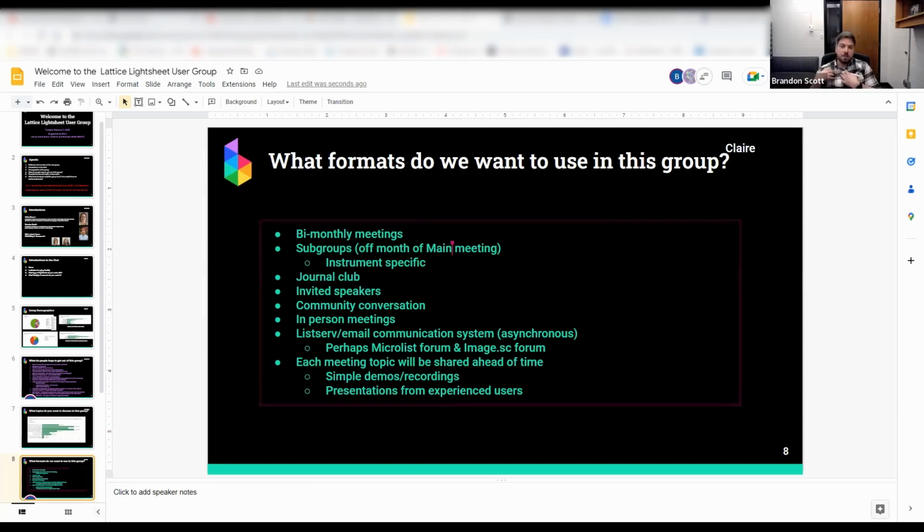At this point, to me, I felt like we've carved out a subgroup, because we've excluded by definition other light sheets that are still doing single cell or organelle, not whole organism. So my 2 cents, with time as well, I'm considering this my subgroup. This is my level, my unit. Others feel free to do that. I don't have strong opinions on making an additional one, because I feel like this is the unit of operation for what I'm comfortable with.